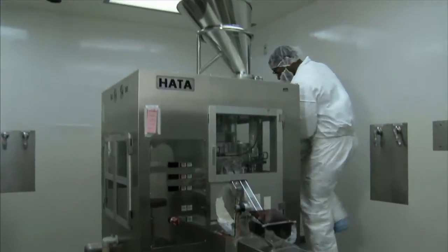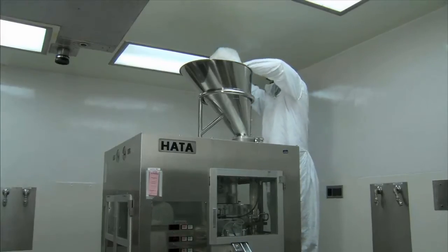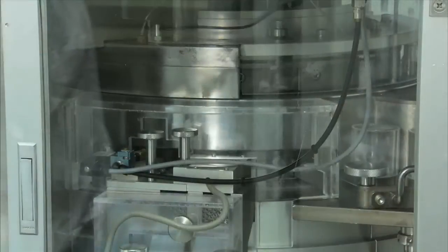The improved flow of Ashland's Directly Compressible Grades of Benicel Hypermelos will enable formulators to make consistent controlled release tablets via direct compression.